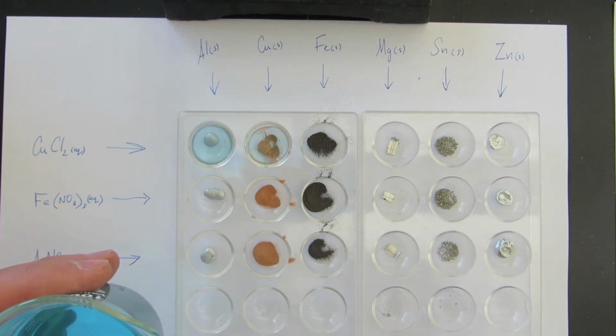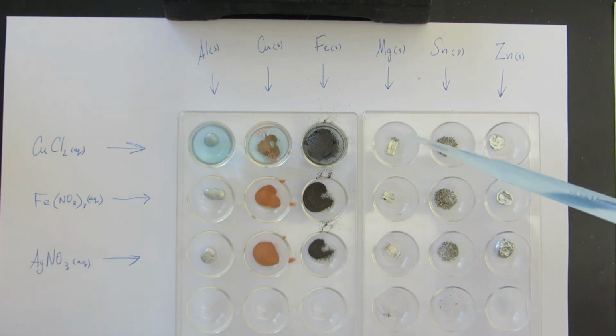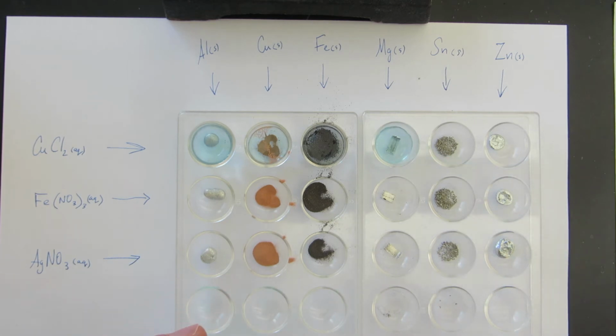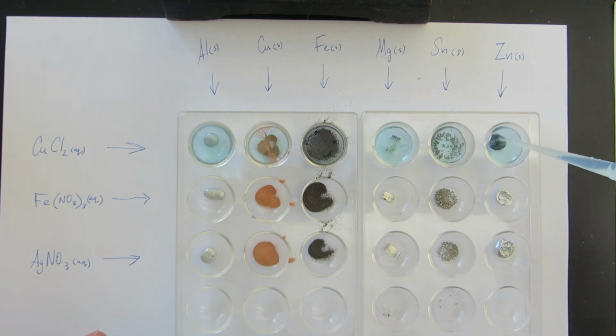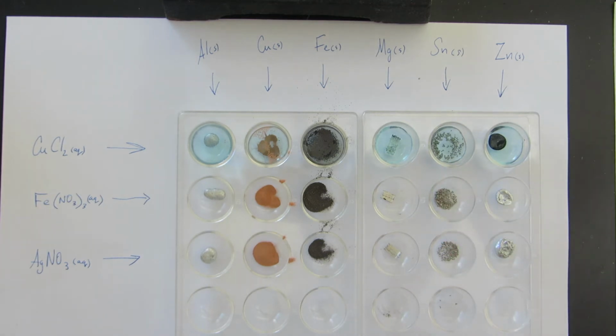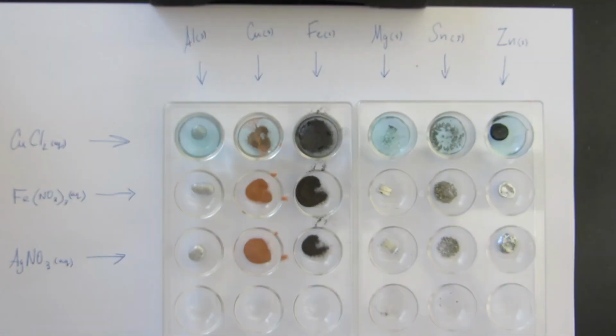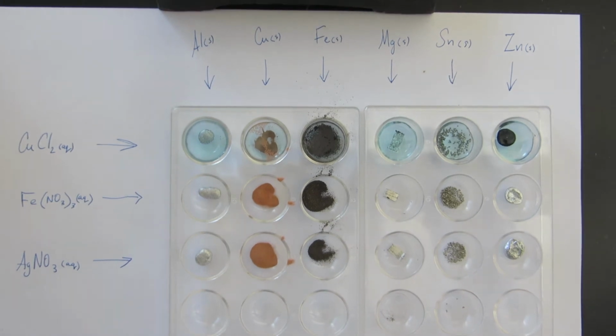I just put copper chloride on top of copper. Okay, so the zinc, you can see the color changed very, very quickly. You can see the magnesium is bubbling. The zoom is not great. And it'll just stay there. Maybe you can zoom in.